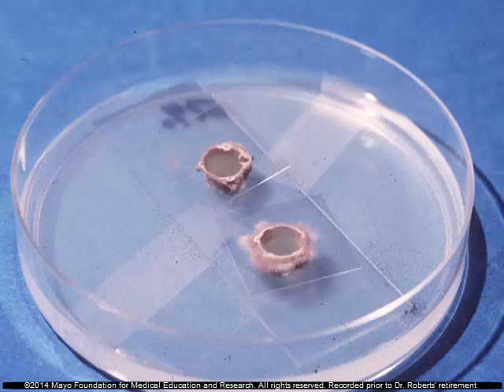The slide's sterile, and you take a little bit of the culture and cut out a circle or a square with a wire or with a sterile test tube. Place the agar plug on the slide in two places, either end. And then you inoculate the four quadrants of the plug with the culture. Then you put a cover slip on top of it.